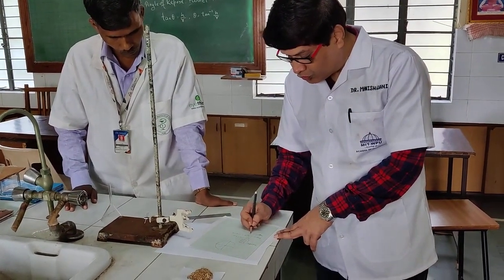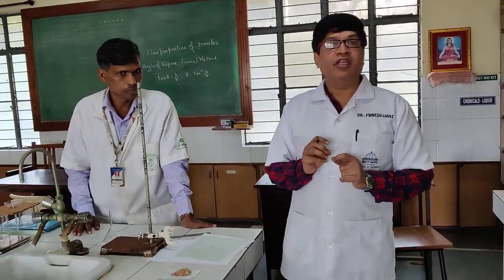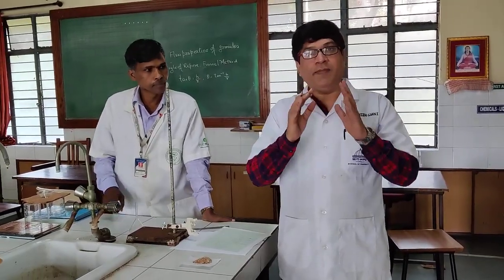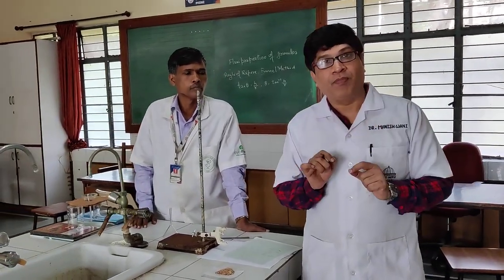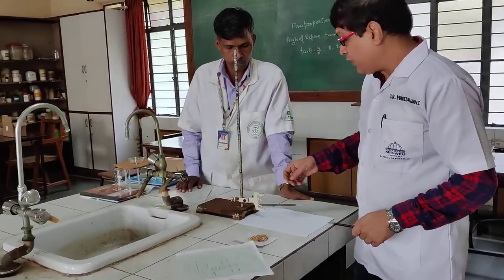Height is 2 centimeter because that is how we have arranged our granules. By chance, if the heap of the granules is not touching the tip, in that case you can also calculate the height.